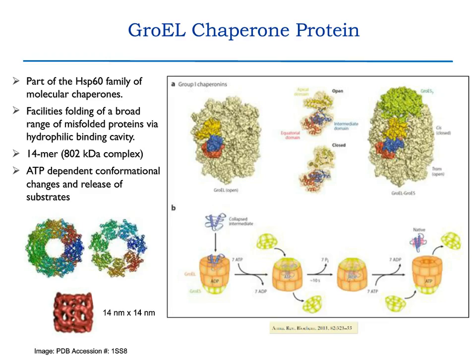They do that by misfolded proteins entering the cavity, folding within the cavity, and then being released in an ATP-driven process as outlined in the schematic on the right. So our idea was to take GroEL, whose role in nature is to bind partially unfolded proteins, and see if we could use that as a detection system for in vitro aggregation. That's outlined in the next slide.